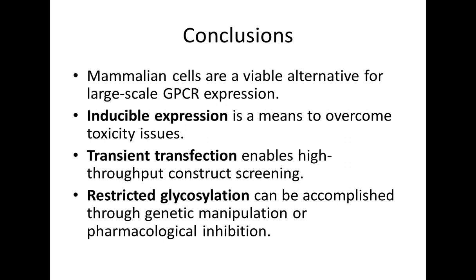Okay, great. And excuse me if I mispronounce a word here, but do you recommend mammalian cells for BRET assay? Yes, usually for BRET, you're not dealing with needing large quantities. It would be a smaller scale 96 well plate assay. And yes, usually those assays are typically performed in mammalian cells because they're looking at signaling and interactions between proteins. And so you basically want your normal native complement of receptors around.